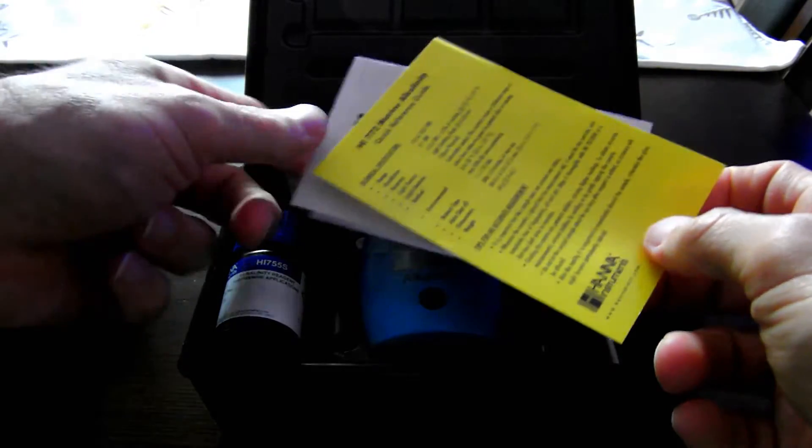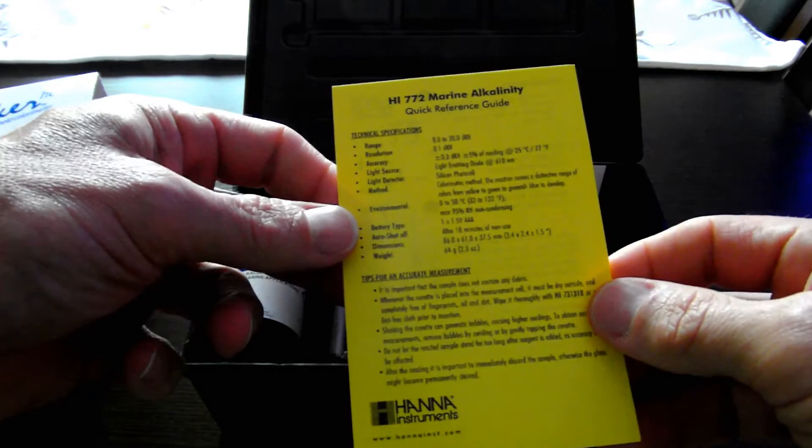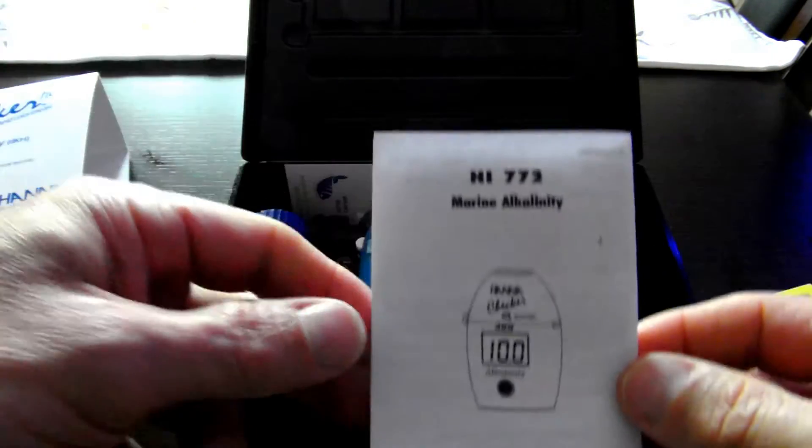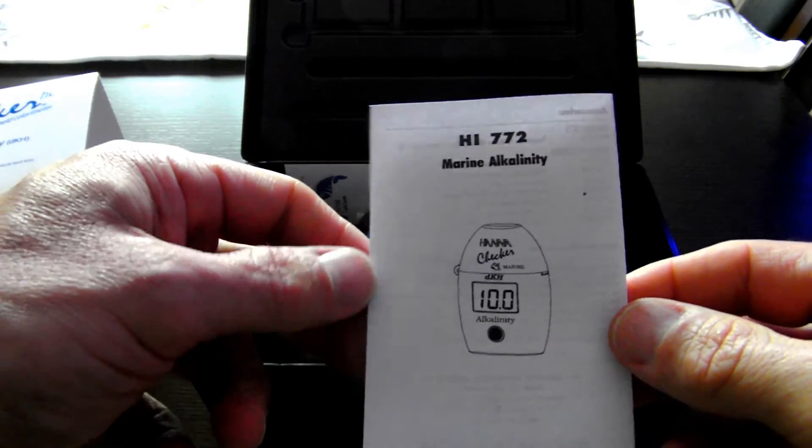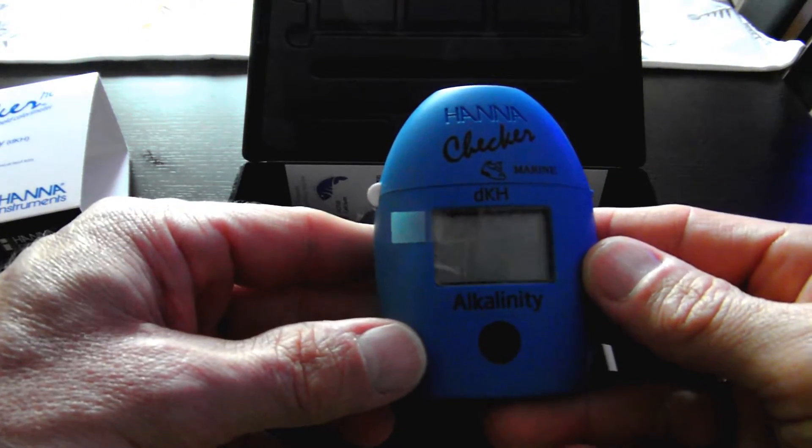We've got some literature here, a quick reference card or guide, marine alkalinity information, a little booklet. Here's the gadget itself, the Hanna Checker.